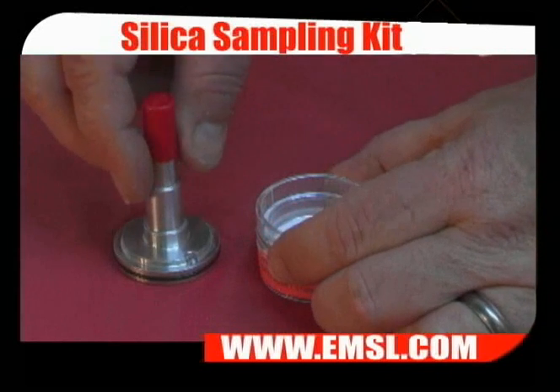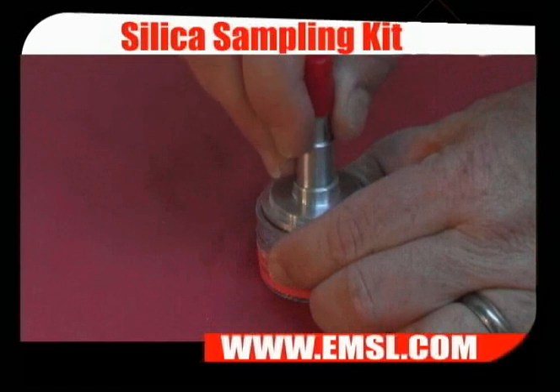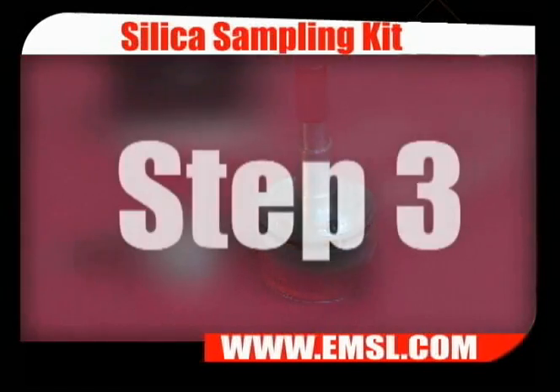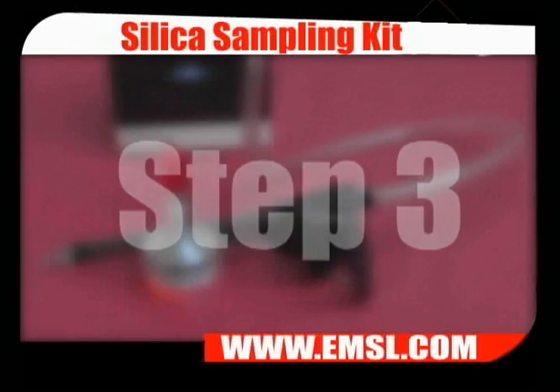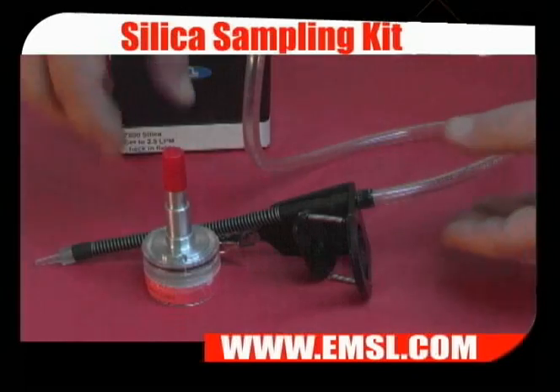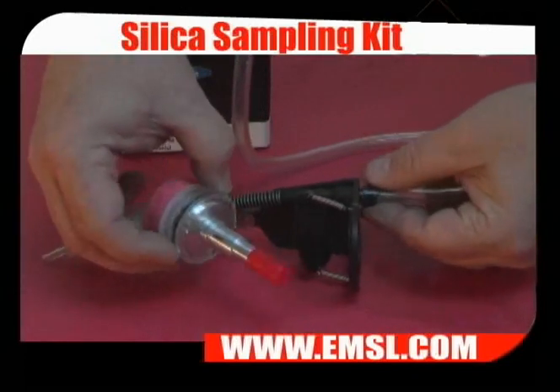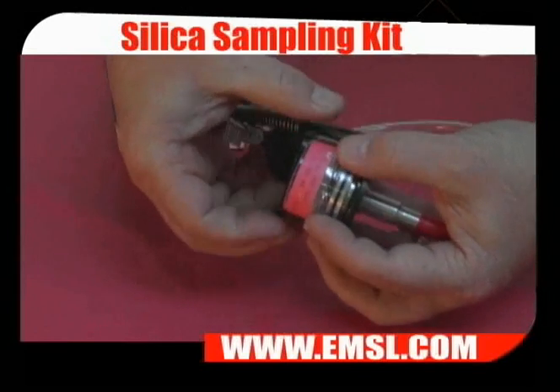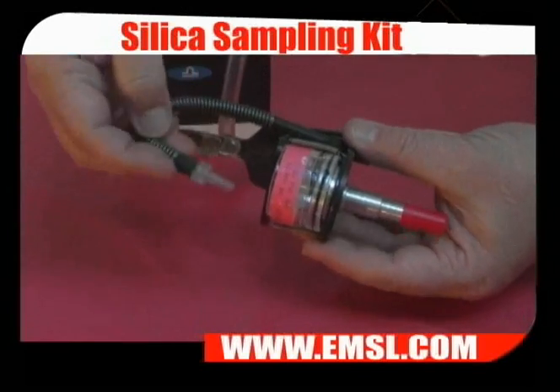Next, insert the cyclone into the open section of the cassette. Then insert the cyclone and cassette into the cassette holder. Attach the hose.